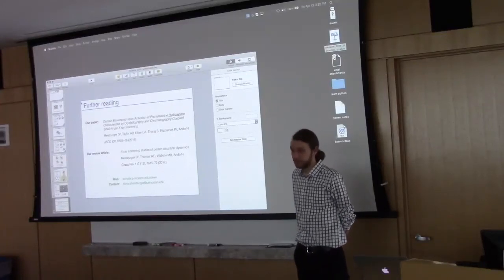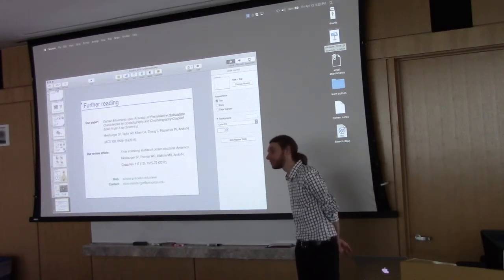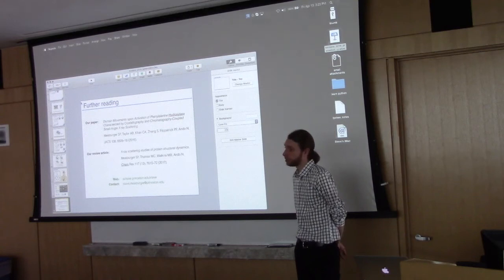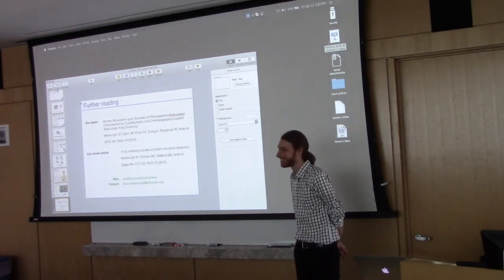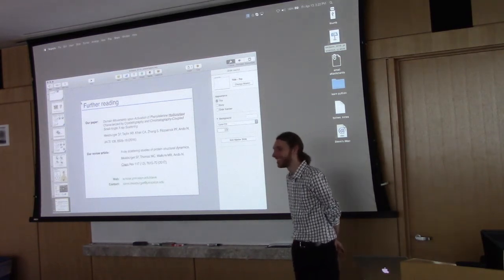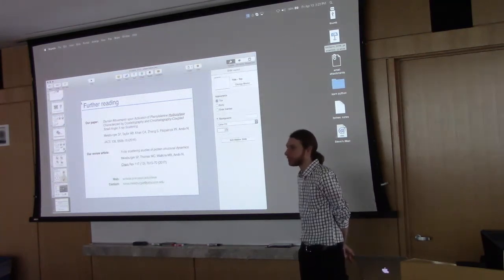That's cool. So I have a question about SAXS as well. You briefly mentioned Emery Brookes' program, Ensemble, and I haven't really gotten into BioSAXS yet. So what are the differences in these methods? Because they all sort of do the same thing, right? Kind of, yeah, with SVD. So what are the differences then?